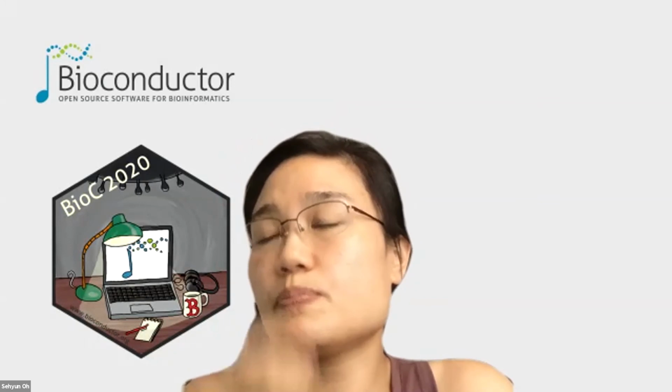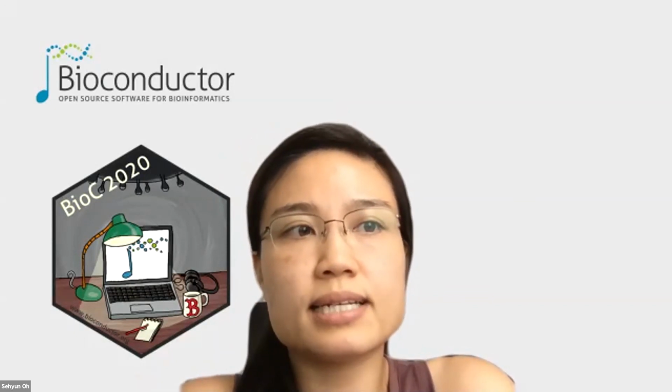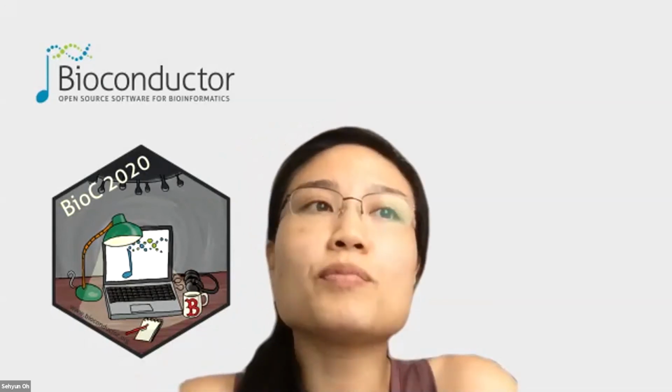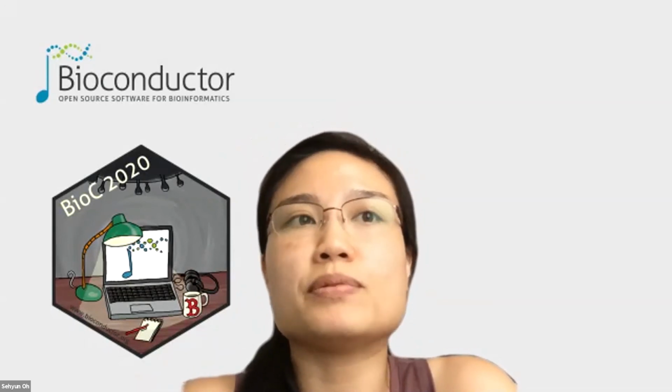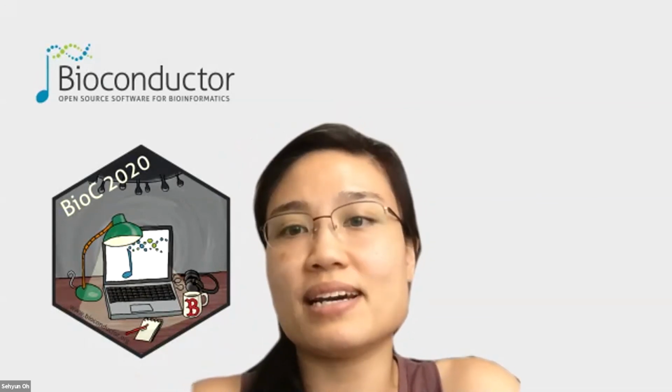So right now, especially if you bring your own data, you can bring any kind of data. Currently, it holds all the different kinds of genomics data, including FASTQ, BAM, VCF, or BED files. And available meaning that, for example, the TCGA consortium should have that kind of data already. But if so, then it's not a problem to use that in the platform.